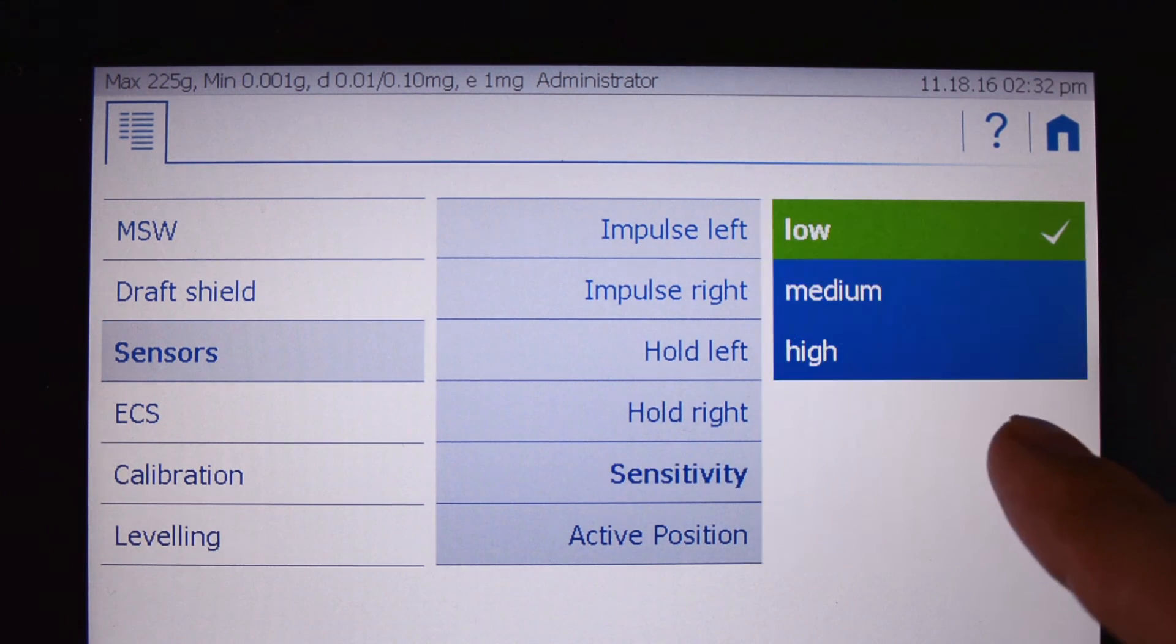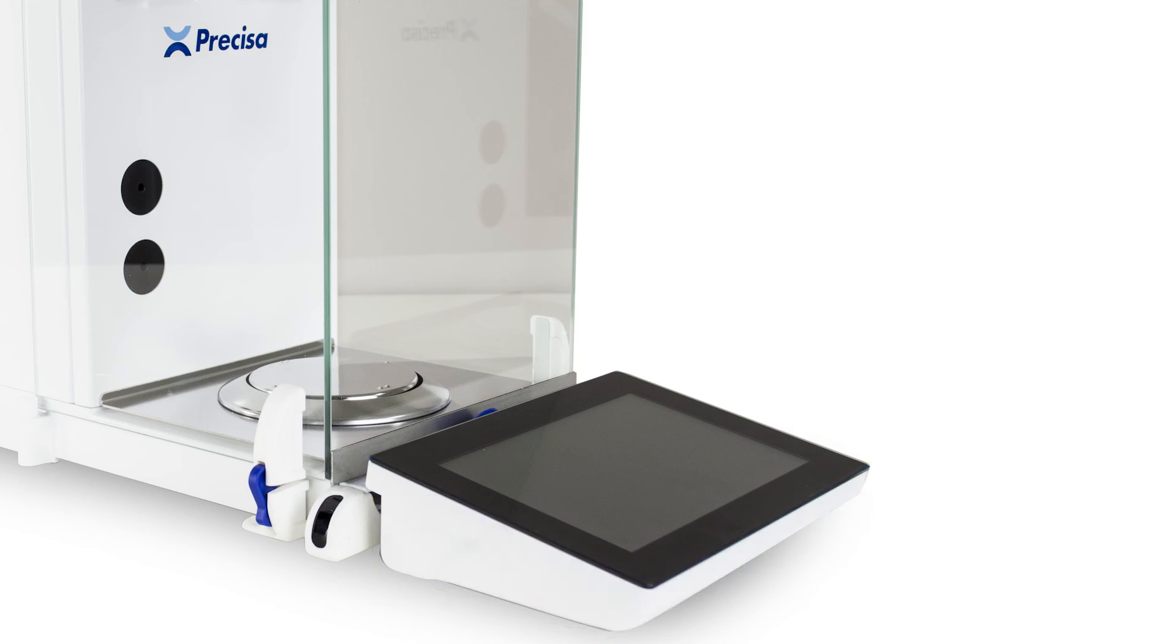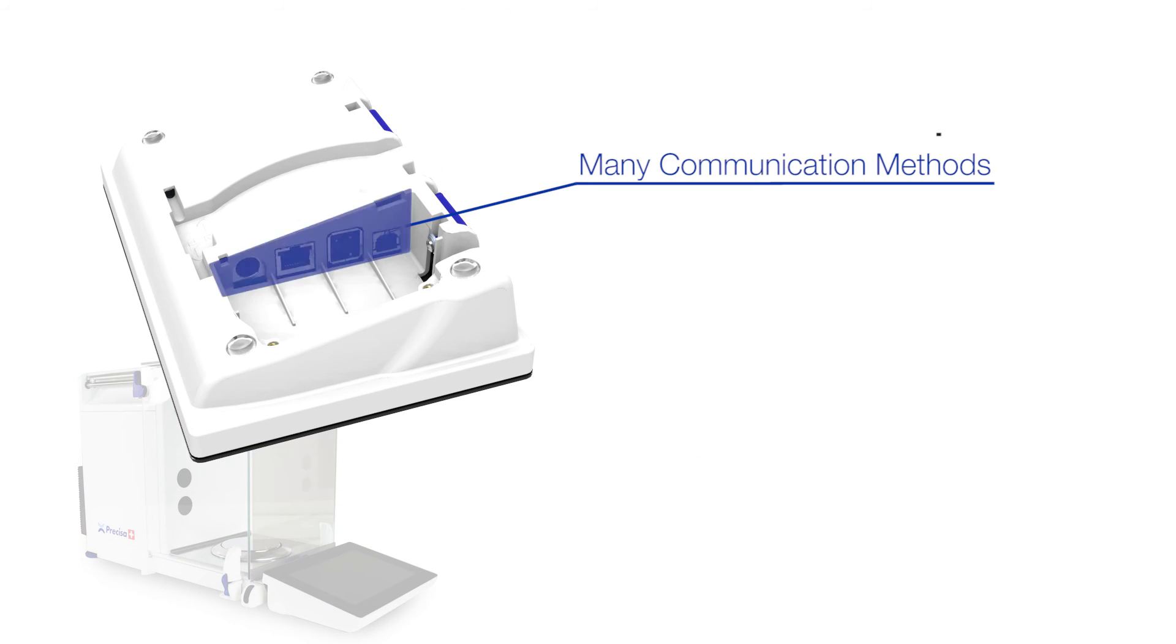The balance also features connectivity with its many communication and interfacing methods, such as USB Type A and B, Ethernet, and RS-232, with Wi-Fi and Bluetooth accessories available.